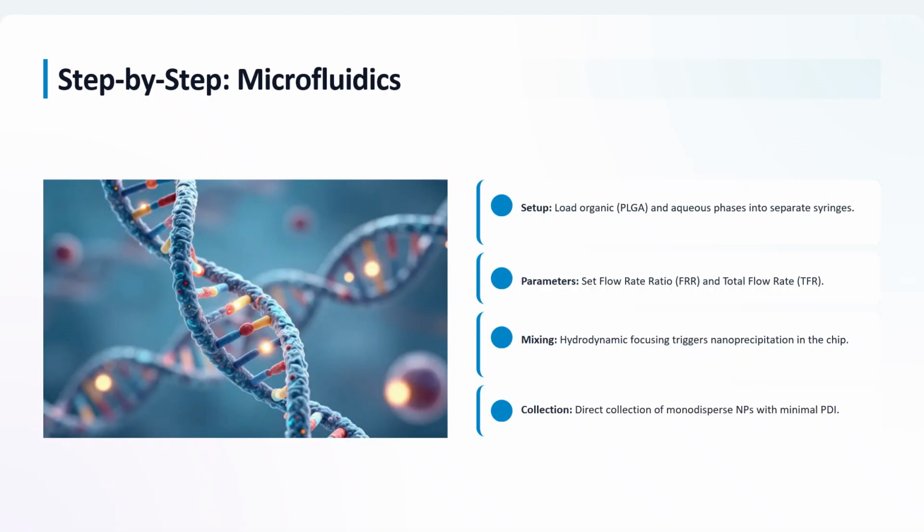Microfluidic synthesis represents a more advanced approach to nanoparticle production. Instead of mixing solutions in bulk containers, microfluidic devices use tiny channels where organic and aqueous phases meet under precisely controlled flow conditions. By adjusting parameters such as flow rate ratio and total flow rate, researchers can control nanoparticle size and uniformity with remarkable precision.